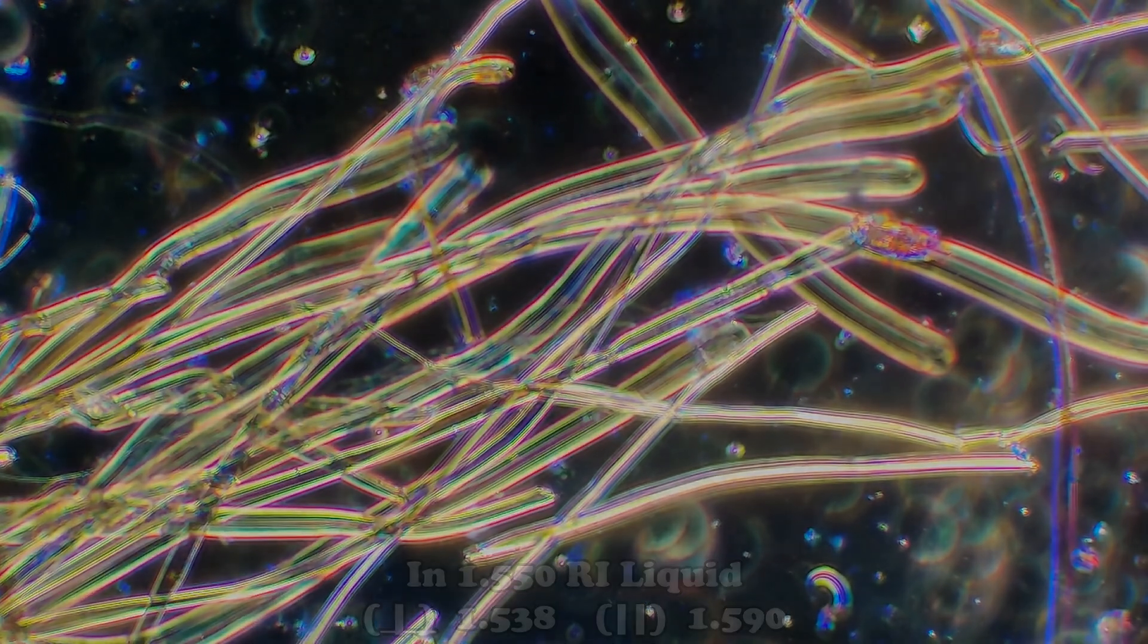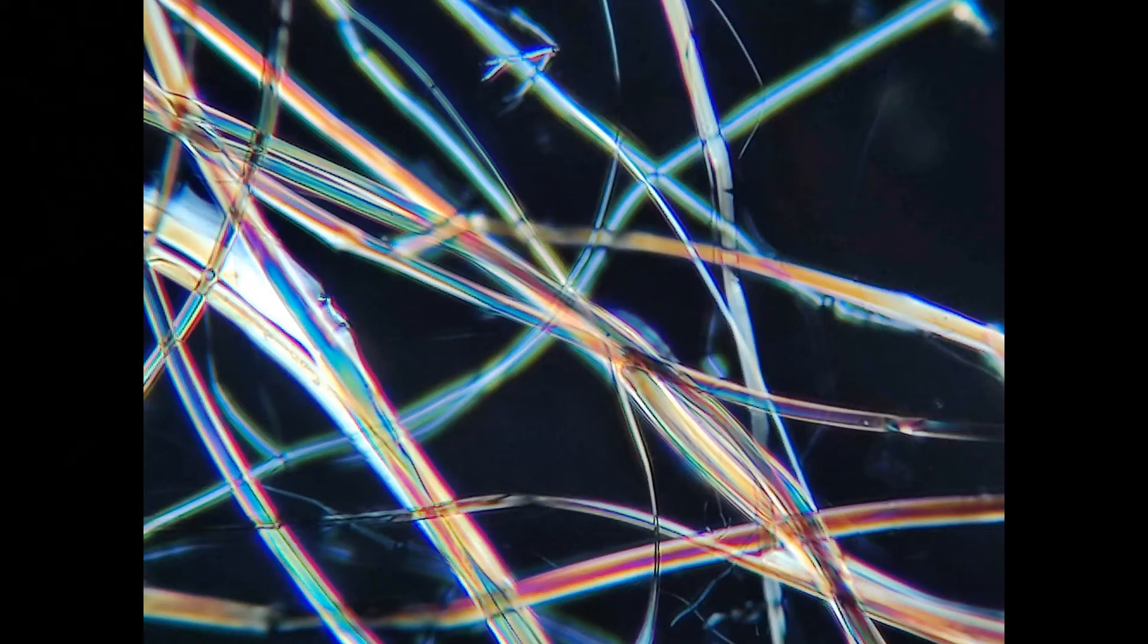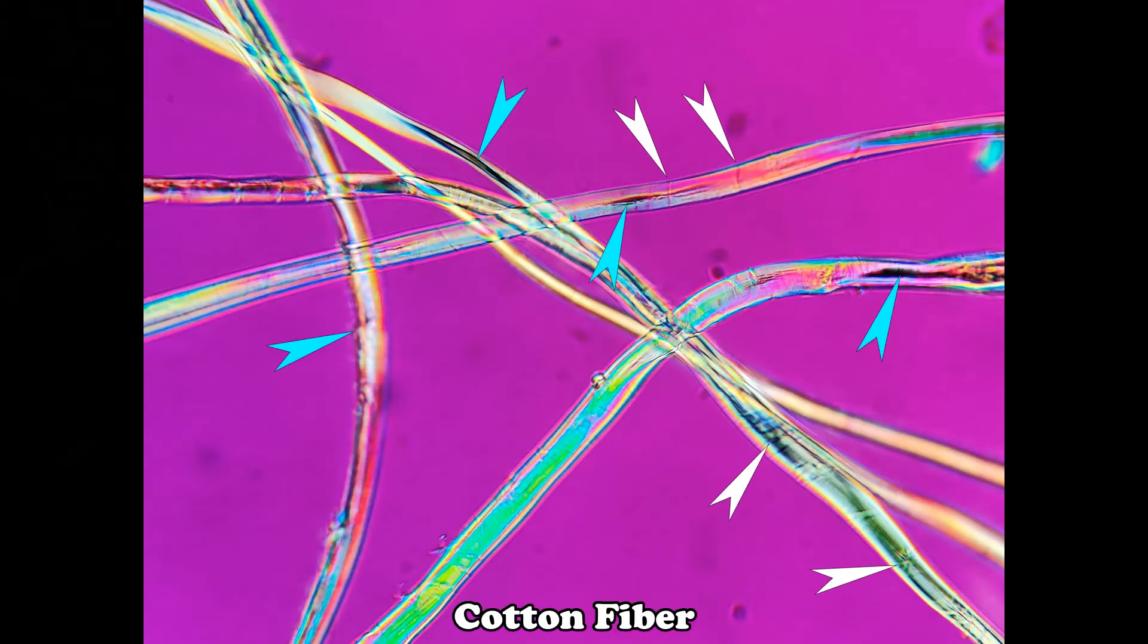This is where you really have to pay more attention to the morphology of the material itself, the smoothness, the variation in the thickness and the cross-section, and specifically, the lack of any surface damage that you commonly find in cotton.